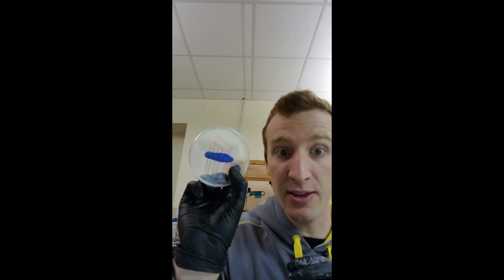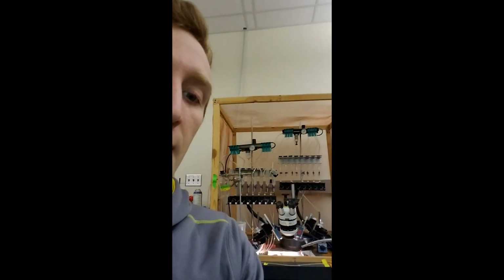Now I have my needles here. Make sure that they are the injection needles and not the impaling needles. Take one, and I'm going to bring it over here to the rig.